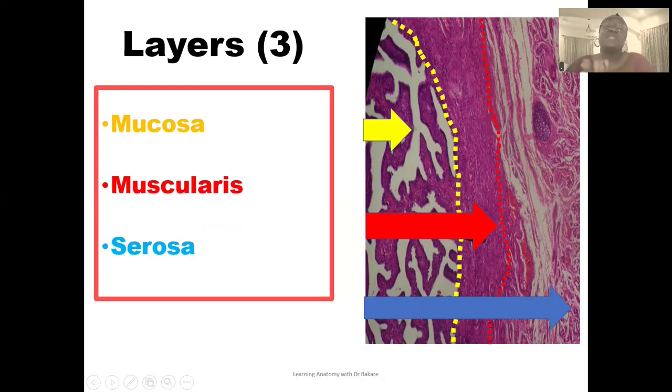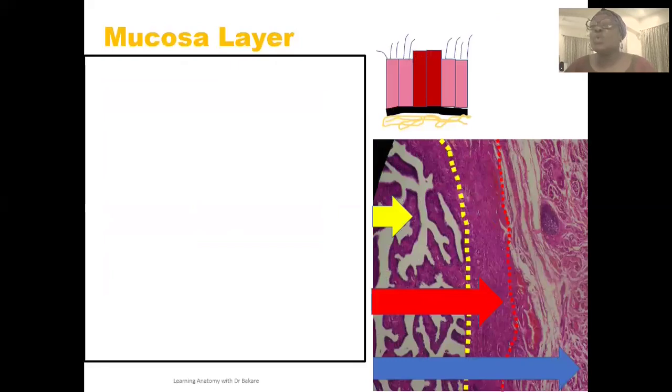So you see that we have three distinct layers of the uterine tube going through the histological section of this organ. We will be delving into each of these layers and explaining the details that they present. We'll also be attributing their features to the functions that they perform in their specific regions. So let's first delve into the mucosa layer.